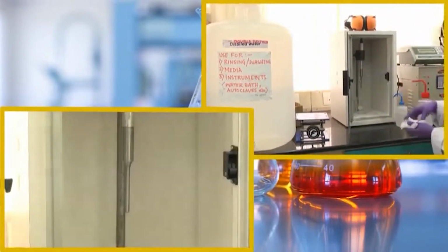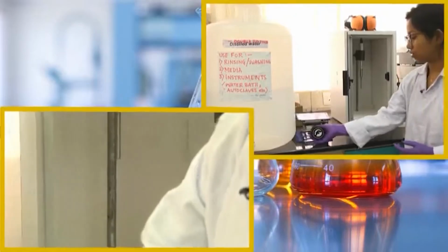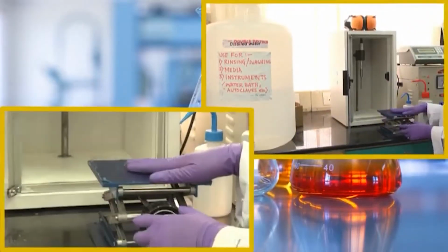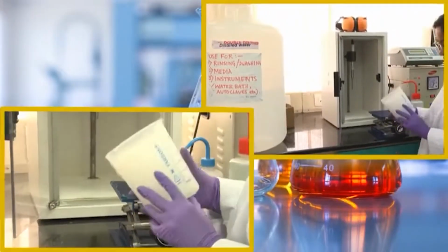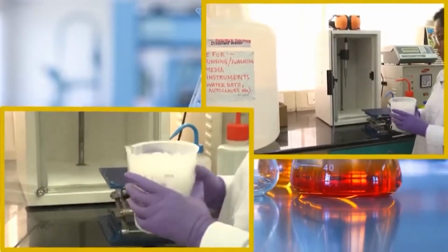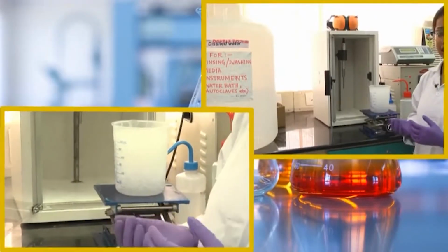So, now the probe has been cleaned and it is ready to use. There is some other instrument. This is a platform, and on the top of it we will keep our sample. As you can see, in a beaker I have taken an amount of ice. Basically, when we use the sonicator, when it generates the ultrasonic sound, it vibrates and it creates heat.